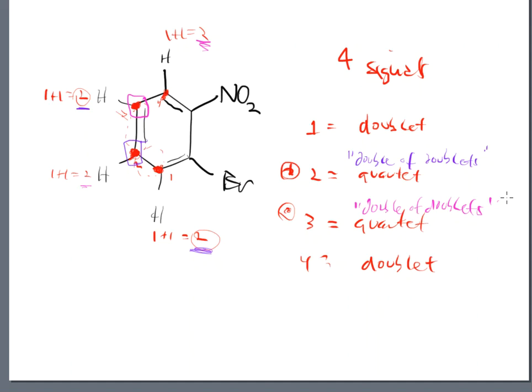So it lets me know that this carbon is sandwiched between 2 carbons that only have 1 hydrogen apiece on them. I mean, that is what that's related to in this example, right? So once more, a little bit about chemical structure, just basically looking at the splitting and the way that that happens, and all of them are at the same height in the splitting on the NMR spectra, and I know that those carbons are not equivalent.